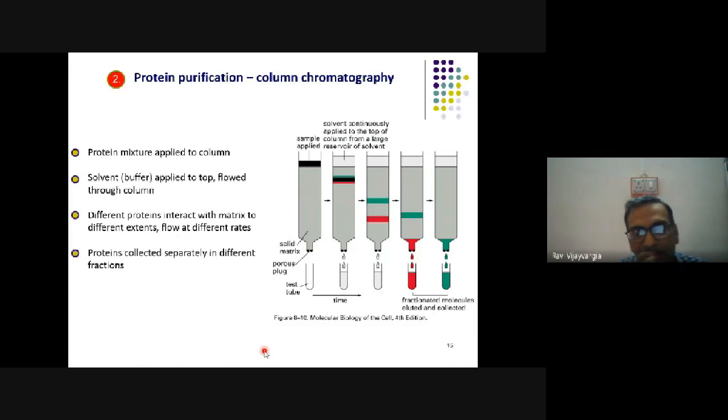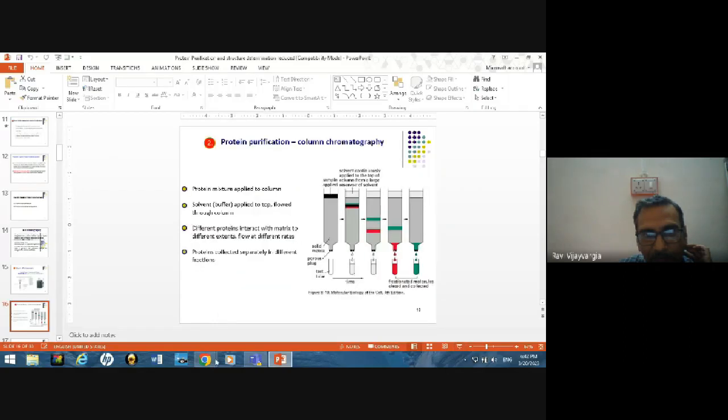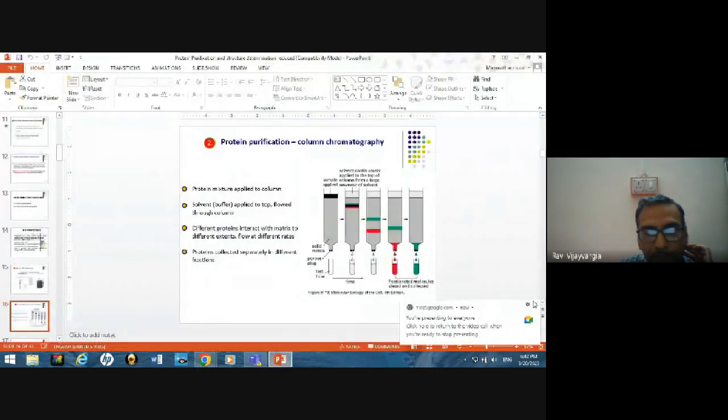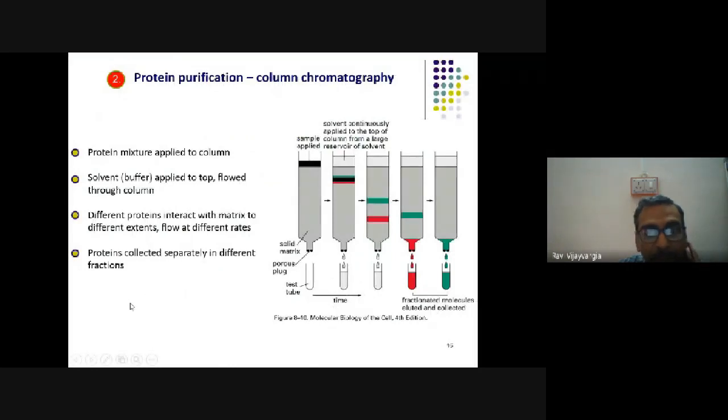So basically, this is a flow chart of all chromatography techniques in general. Whenever you apply a mixture of protein to the column, this is a sample, and how it interacts with the stationary phase of the column will allow for separation of the components. So you see, originally it is black color, and then the components are getting visible again.